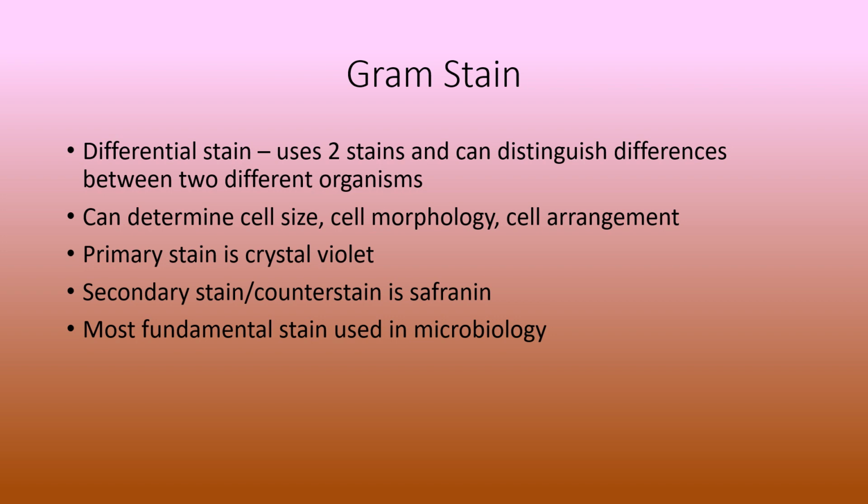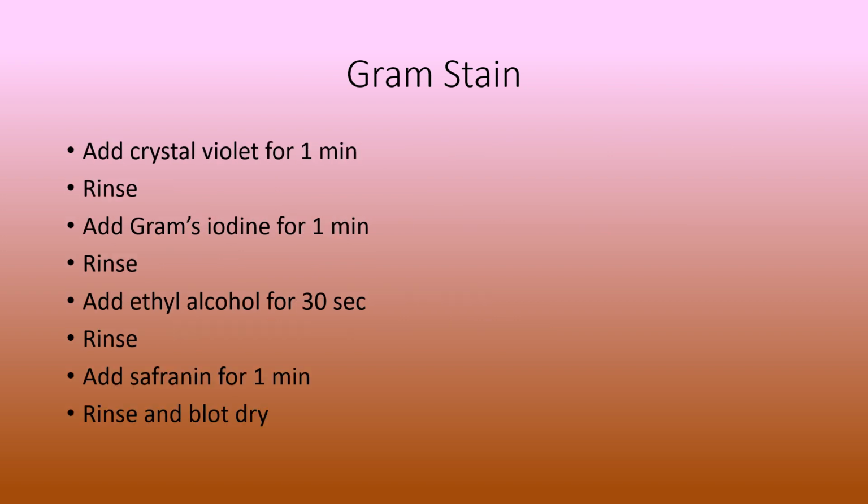Like I said, this is by far the most fundamental stain done in microbiology. So if you're working in a lab, you need to know how this is done. As with most stains, you would have taken your sample, made a smear on a microscope slide, and heat fixed it already. Those you assume are done first.